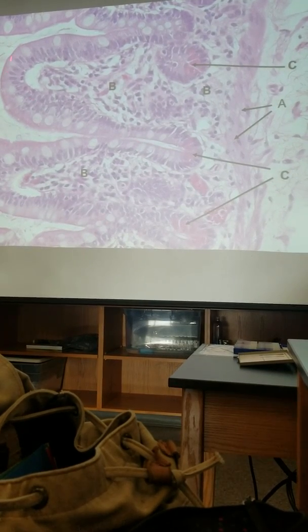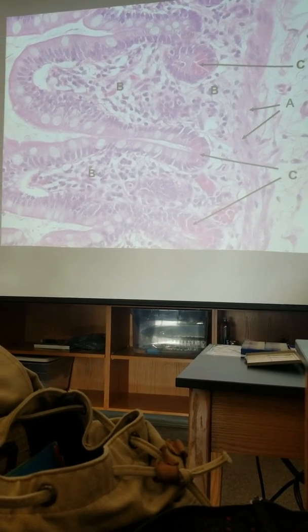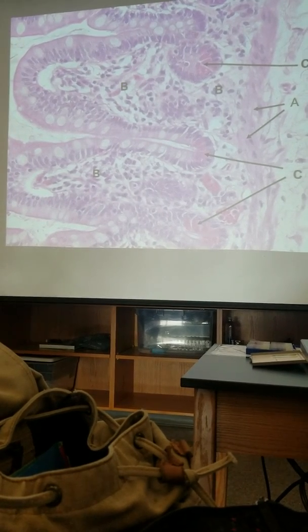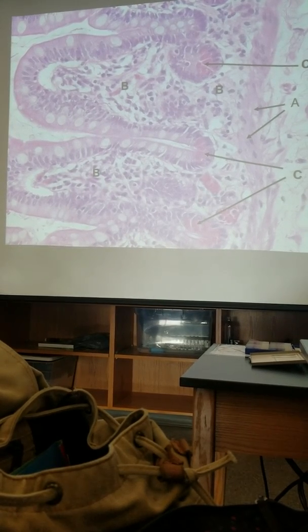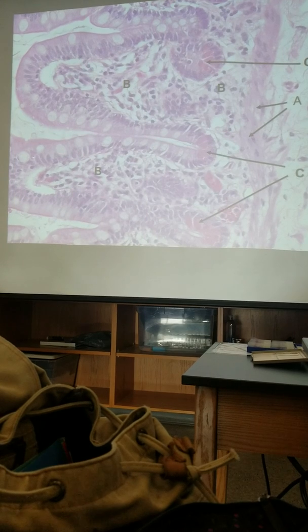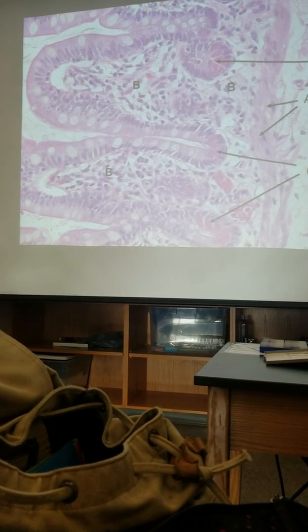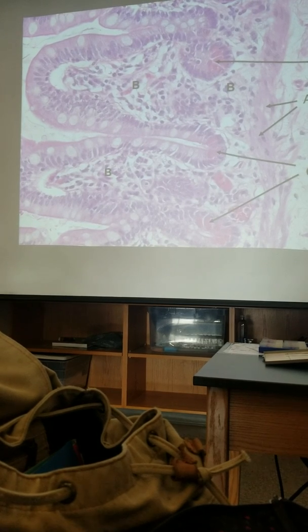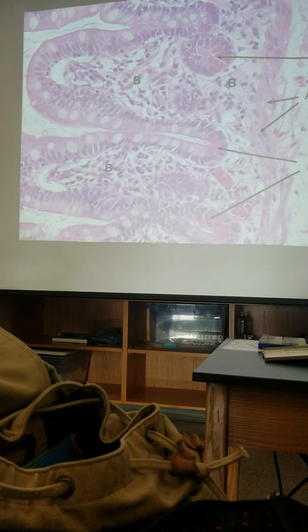The shape of the villi, those look pretty tongue-shaped to me. So based on the shape, I would think duodenum, but once again, we don't have submucosal glands. Look at the number of goblet cells. So now I'm starting to think it's probably not duodenum, it's probably something a little bit further down the intestine.